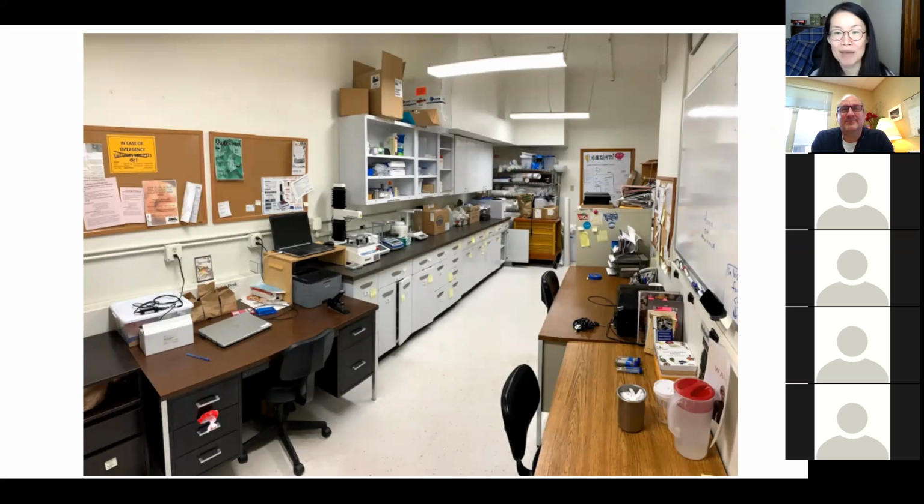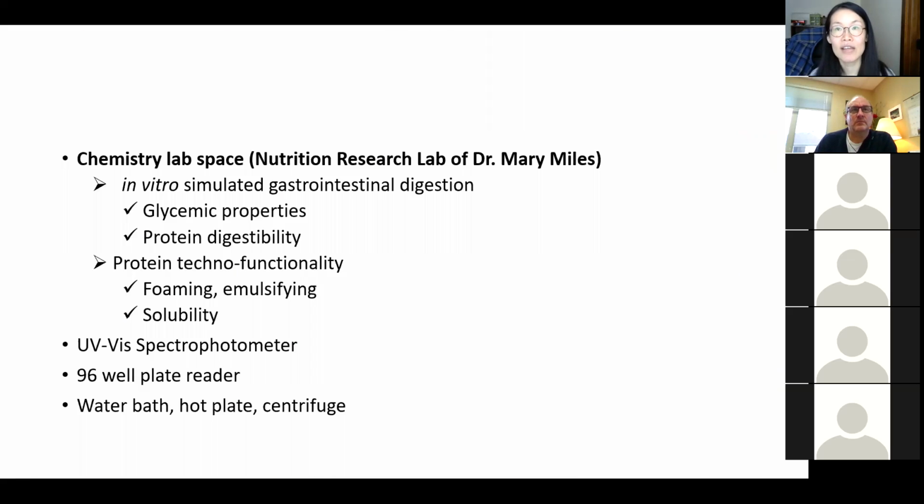This is the lab space that my graduate students and undergrad students hang around. We also have a supply of sensory testing materials. On the bench, you can see the texture analyzer, and we also have the moisture analyzer there. That is our sensory and food product development, recipe testing, R&D area. Primarily, it's the Hannon kitchen that we co-manage with the culinary arts program.